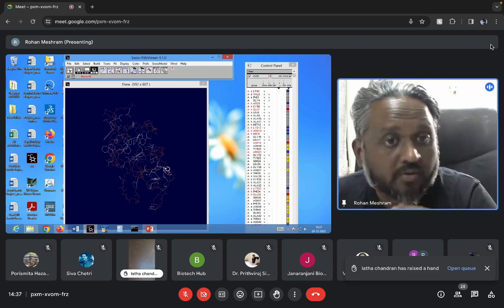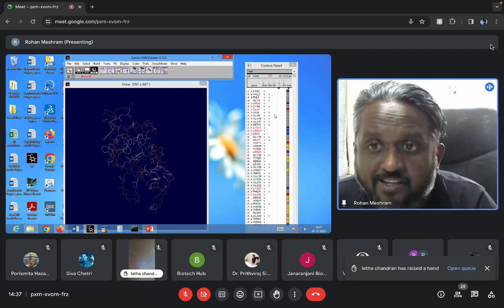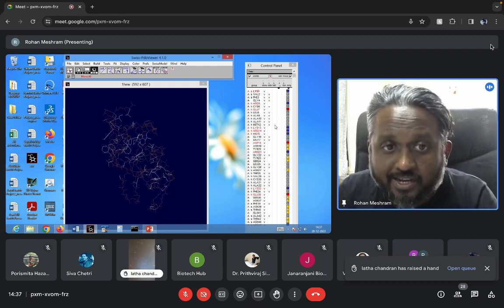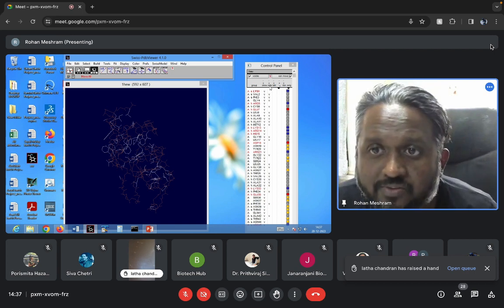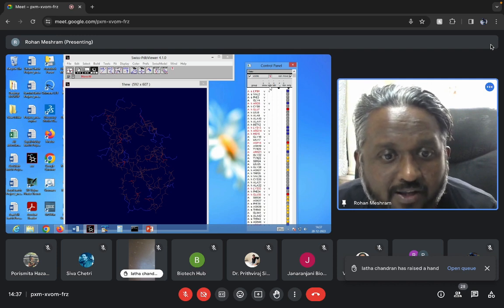And you would note a very strong contrast in this case. What is the contrast going to be? That all the acidic and basic residues, not even one will be oriented towards the inside. All of them will be oriented towards the exterior. Well, let us see if that is the case. Right? Are you seeing it here now? What happened?